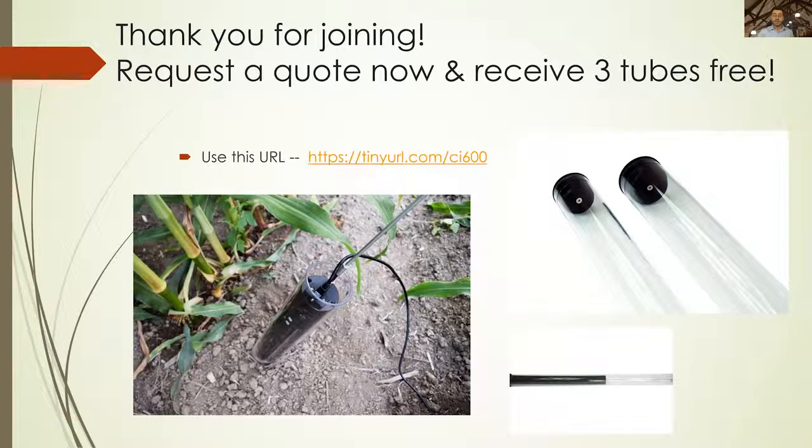The next question is, how much faster is the 602 compared to the 600 at the same DPI? In trials, it's actually been about twice as fast. We found it's a little slower when it's cold, but it moves at a much faster pace than the older 600s. Actually, more updated 600s are moving faster, but as technology increases in one, technology increases in the other.